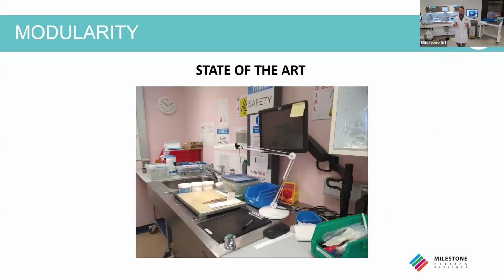This is just one image to show you how the setup is now. As you see, there are trays, buckets, a formalin Tupperware, no ventilation, a standard cutting board, a monitor for an LIS system, and nearby you see a notebook, probably for the documentation, which is definitely not standardized.